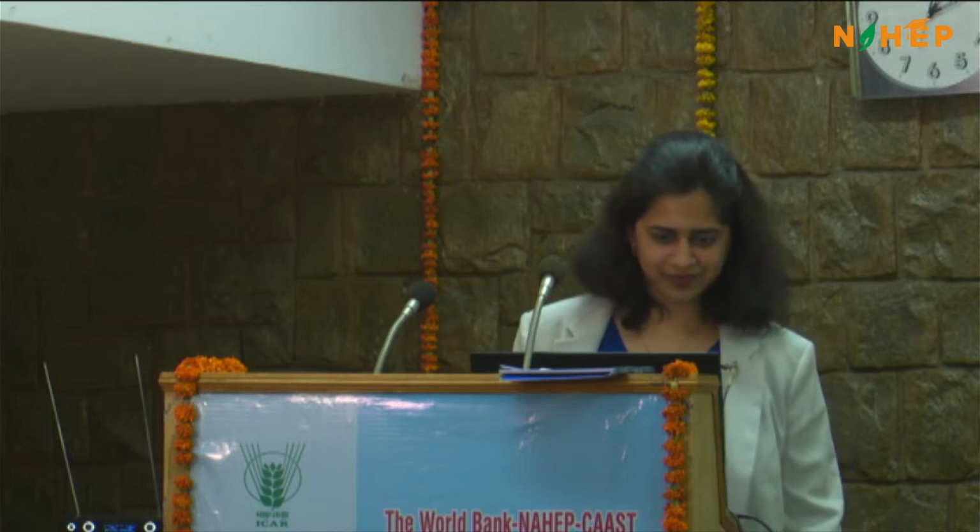It's good that she is asking this question. I'm sure this kind of doubt must be in everybody's mind, at least those who want to learn. What Akshita is trying to tell is that in any sequencing project, data curation is an integral part. Data curation means two objectives. One is removing poor quality reads from the data you got from the machine, which is judged by quality values, as Akshita already told.